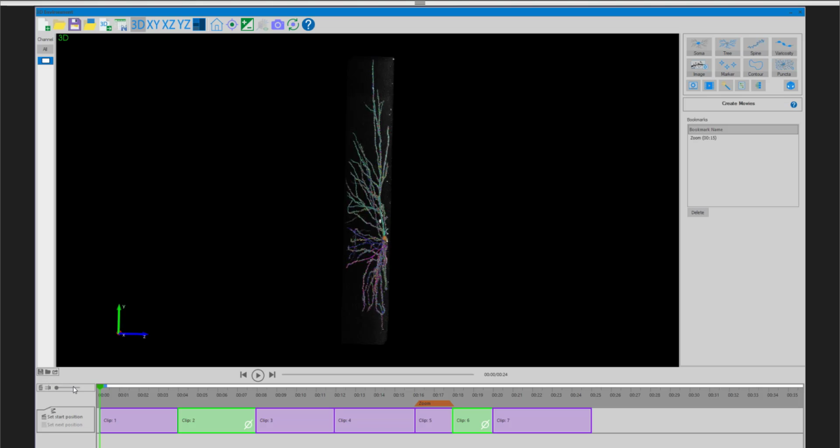By going to the open folder, it's going to look for this XML script. And like I said, if you have the same resolution, the same rotation and zoom will be applied to the image stack and data file. If the image stack or data file is a different pixel resolution or dimensions, you can still work with the same script, but the results will vary.